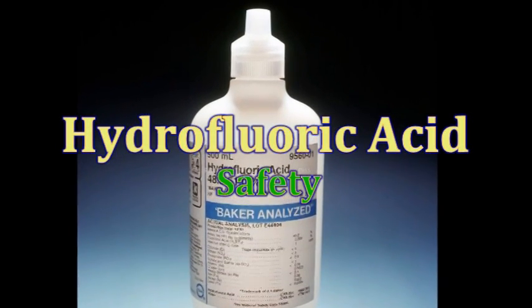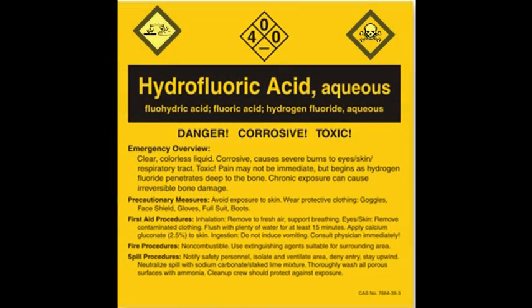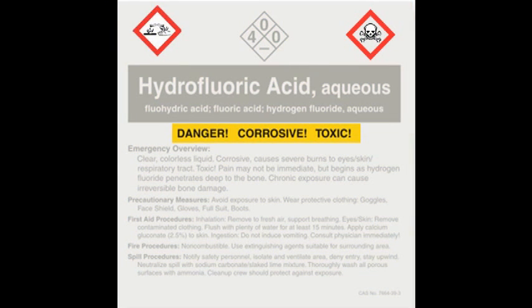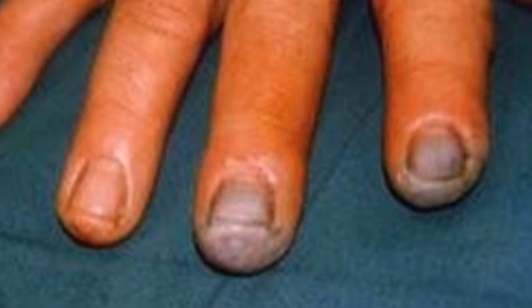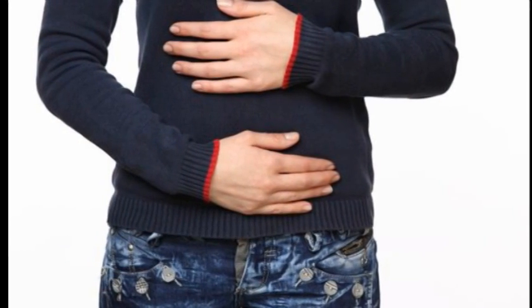Hydrofluoric acid is a dangerously corrosive and toxic chemical that is clear and colorless, similar to water. This video shows university laboratory personnel how to safely work with hydrofluoric acid, or HF. The hydrofluoric acid liquid and vapor causes severe burns that may not be immediately visible or feel painful. The chemical is very toxic when in contact with skin, inhaled, or if swallowed. Hydrofluoric acid is corrosive, causing burns, tissue necrosis, and can be fatal.